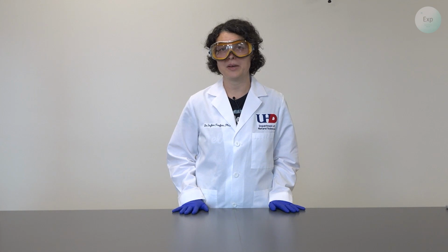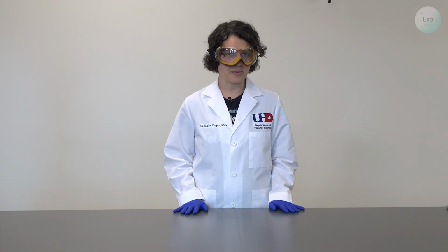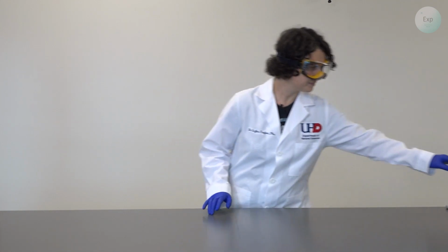My name is Dr. Esther Trufan, and in this video, I'm going to demonstrate how to determine the solubility of ionic compounds in water. For this experiment, we're going to need some equipment.